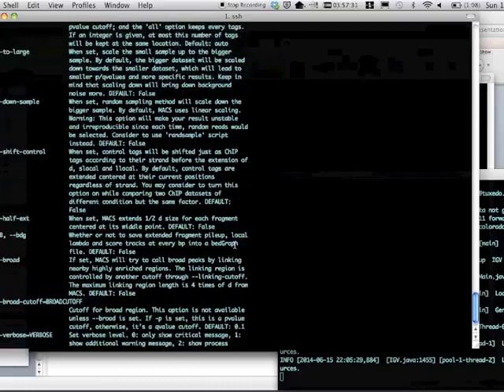And for each step of the job processing, in this case, we're saying for all of them, we can get an email notification at an email address we specify, so that every time the job is either queued up, or leaving the queue and started processing, or completed, or maybe canceled for any reason, we will get an email notification letting us know what happened to the job.